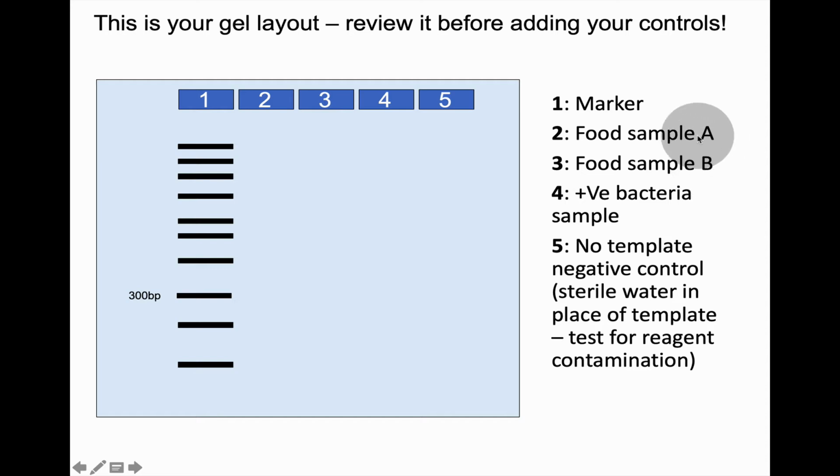So these could be duplicates of the same food sample, where you do a duplicate of the experiment. For example, sometimes in a company I worked in before, they would test the sample in one office, and then equally the sample would be tested by a different person in another office on another part of the planet, and then the results had to obviously be the same. It was really making sure they had a duplicate, independent verification of the result.